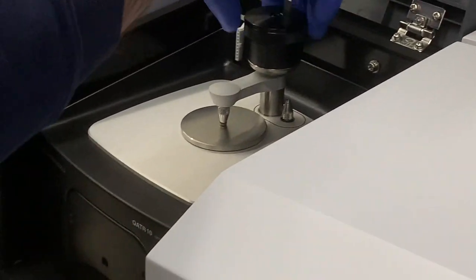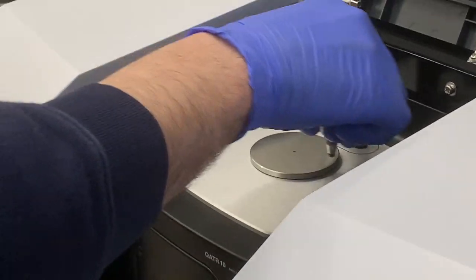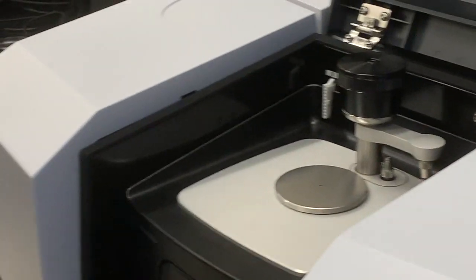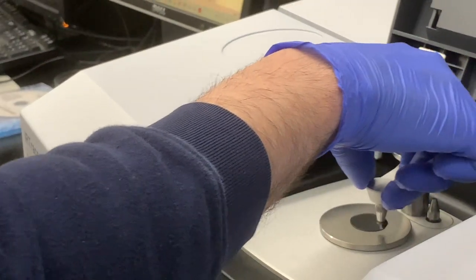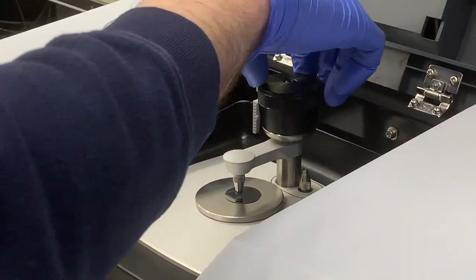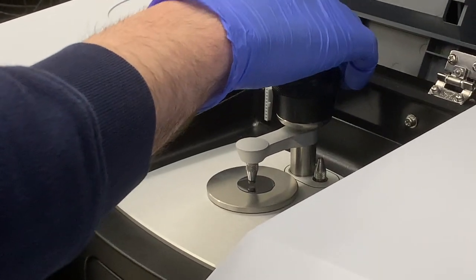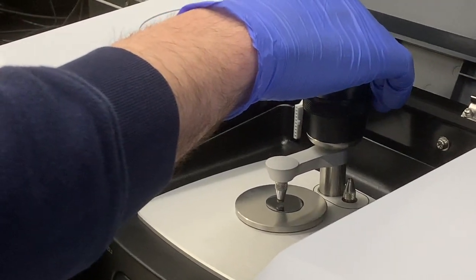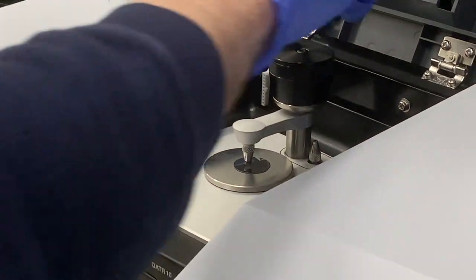I think if anything, it'll probably be a minute difference, because we're talking about cis and trans, between those alkene stretches. I'm not even sure what this is in terms of cis and trans. It's stereochemistry. So say that we have two isomers. How different would they look on the FTIR? I see. And what are they in this case?